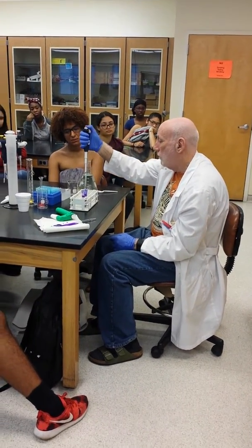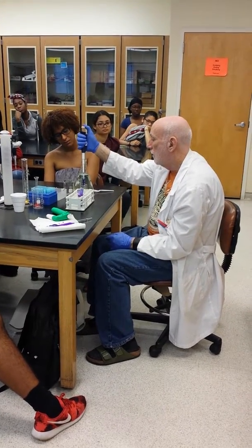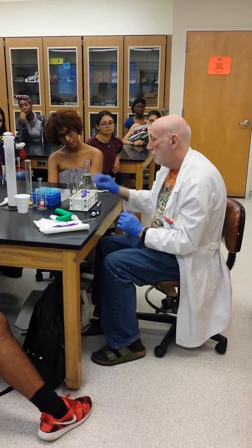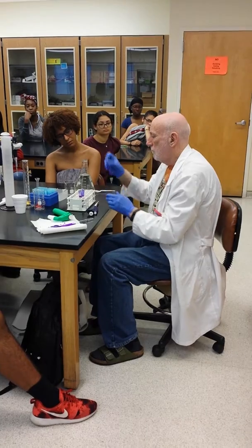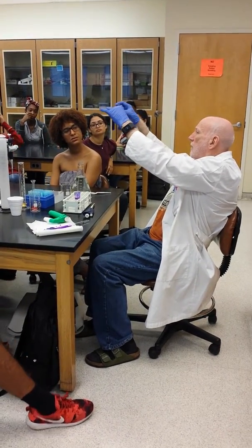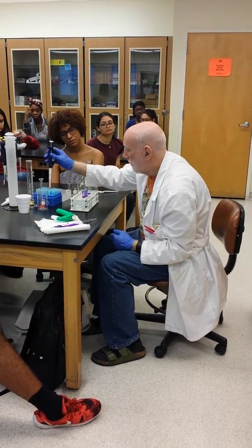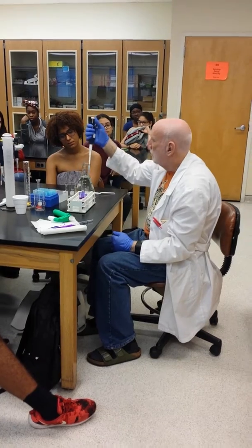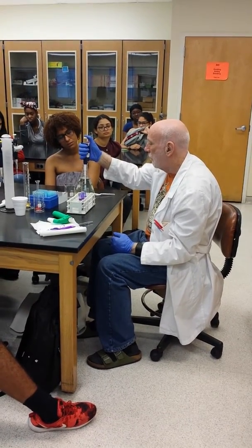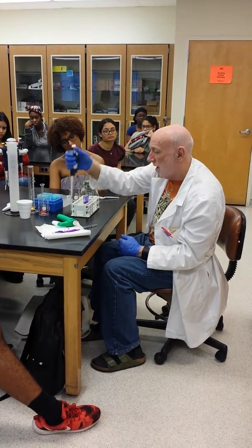I'm going to take out 1 ml out of our 100th. What's our concentration now? This was 100th. This is now 1,000th. By the way, the technical name for what I'm doing now is called serial dilution, diluting by a factor of 10.